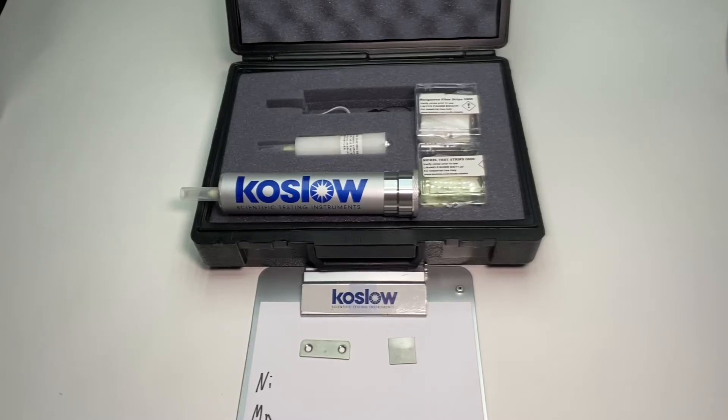Hi, I'm Wolf from Koslow Scientific Company and today I'm demonstrating the new stainless steel manager kit 1546.